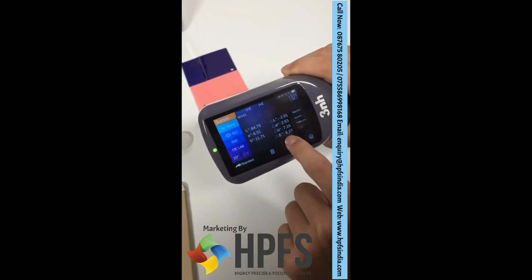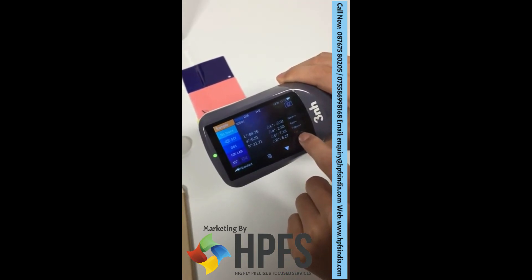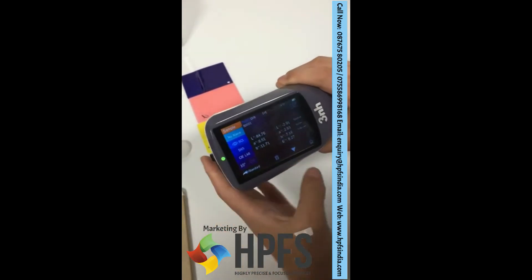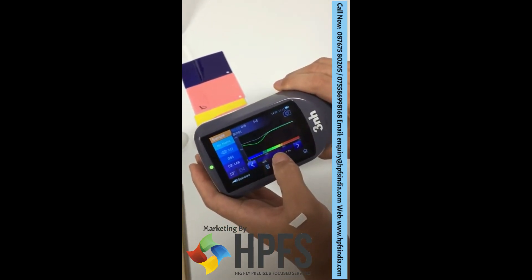Because delta E is higher than one point, it shows fail. Here you can see the color reflectance rate curve.